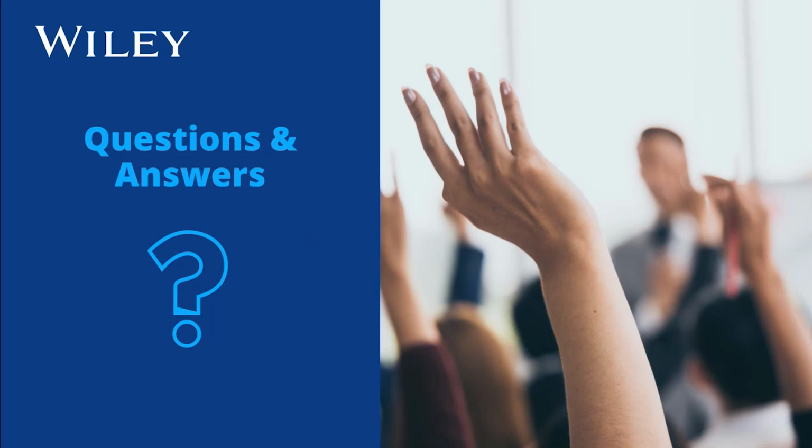Thank you for that, Michelle. How about this one? If I am building a database, can we put multiple runs of a sample into the same record? Yes, we can. Database building and holding a different type of spectra in the same record, as well as different runs of the same type of spectra in the same record, is one strong capability of KnowItAll.